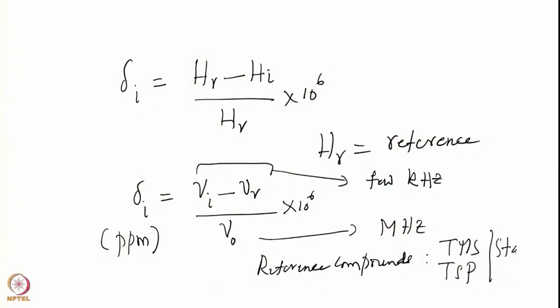What are the other requirements for the reference compound? It has to be stable. Preferably it has only one line or fewer lines. In such situations you will have a good reference compound, and that is what is used in all of these cases.